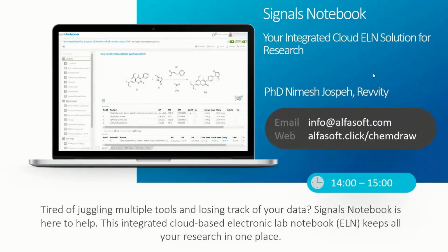We also have applications to manage in vivo studies. We have a specific application called SIMA, which is Signals Image Artist, to manage and analyze high content screening data with the Phenologic AI built into it.